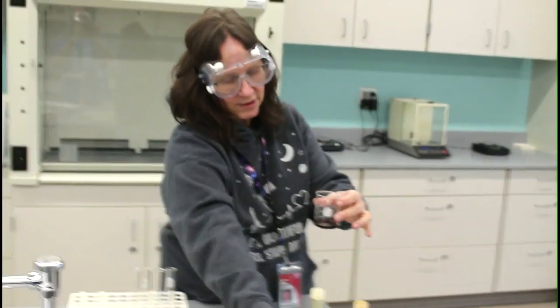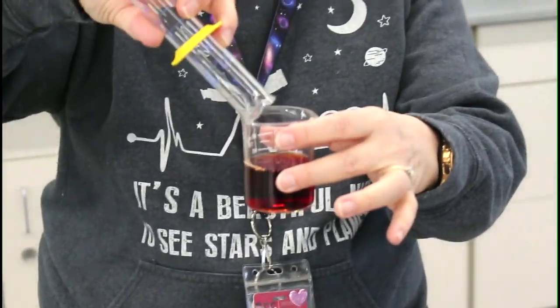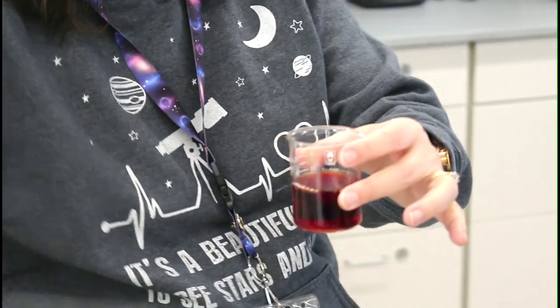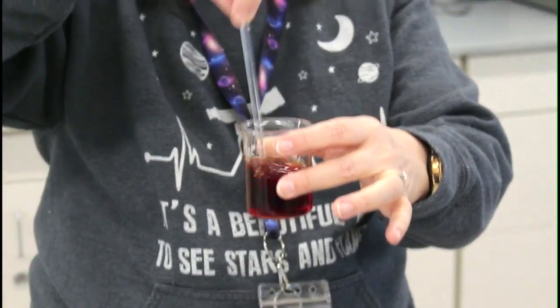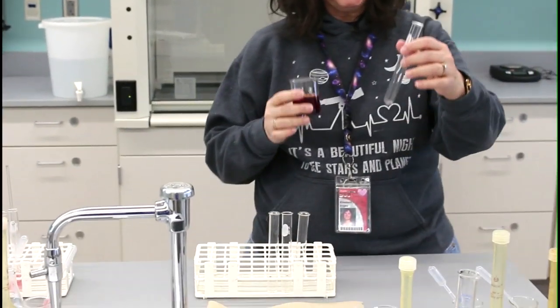The next thing it says is we're going to dilute that up before we go ahead and stress it. So we're going to dilute up the equilibrium. This is just 50 mils of DI water. Oh, very nice. And I've got some stirring rods here. We'll go ahead and make sure we have that homogeneous. All right. So your instructions say to go ahead and fill 5 milliliters in each of 3 test tubes.